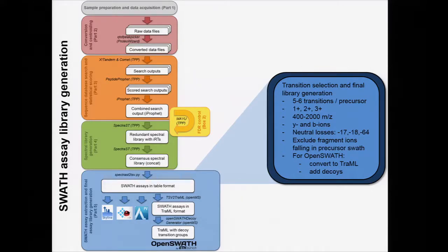Right. So these steps essentially correspond to the peptide and transition settings tabs that you have in Skyline. You're just deciding some set of heuristic rules that narrows down the library spectrum into an assay, essentially. So a set of fragment ions that you're going to use to extract. So this is basically what we're doing here. And there's more detail about what you may and may not want to do written down in the paper. I just picked out the most important ones here.